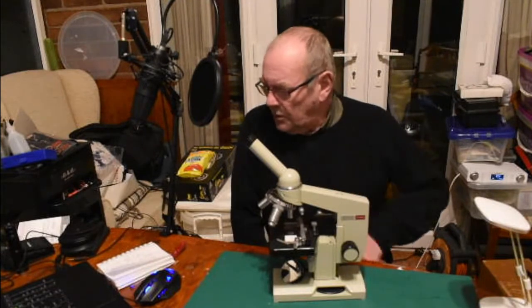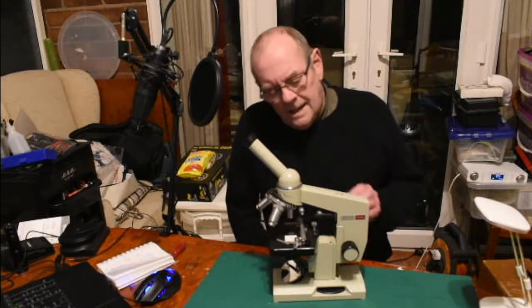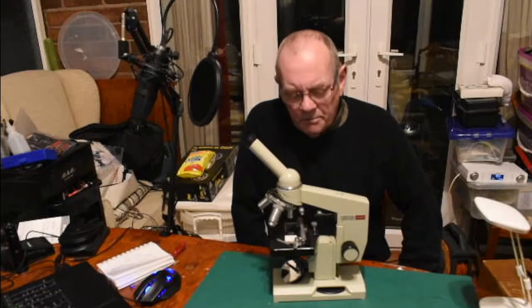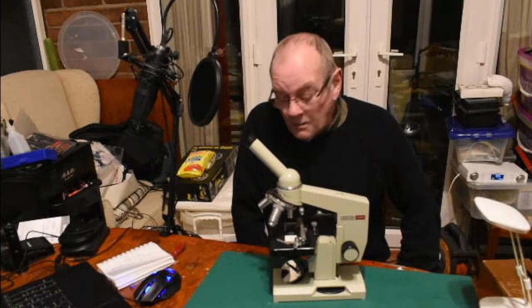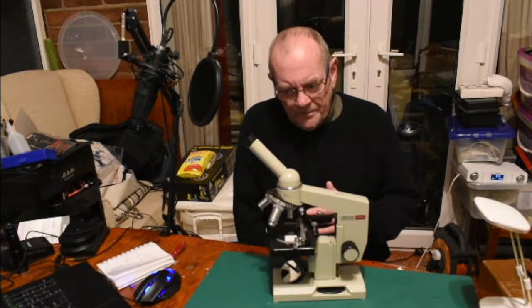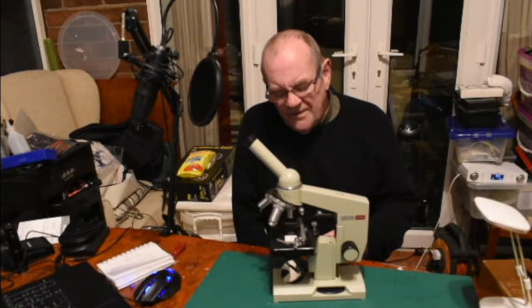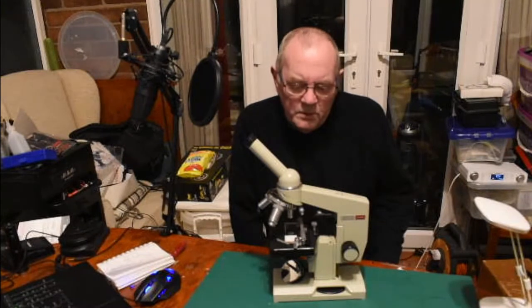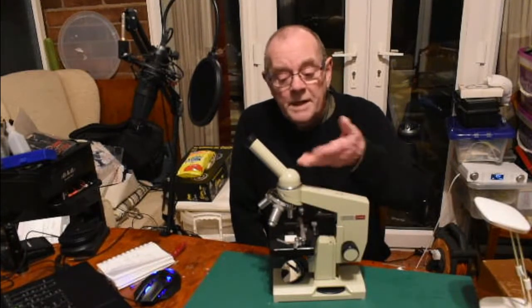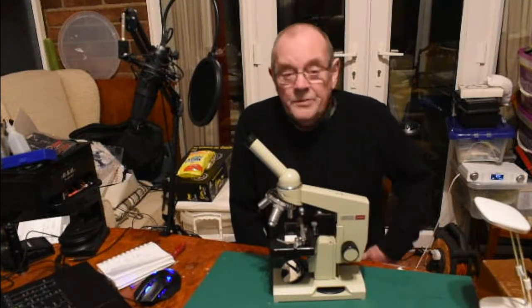If you want to get into this hobby, the worst thing you can do is buy a cheap new one. When I say cheap, I mean anything below — and I'll probably get hammered for this — below 100 pounds. You're not going to get much for your money: the optics are probably poor, there'll be flimsy bits on it, it just won't stand up to it.